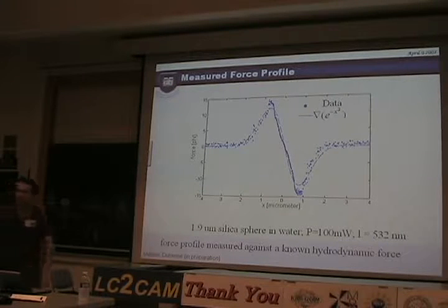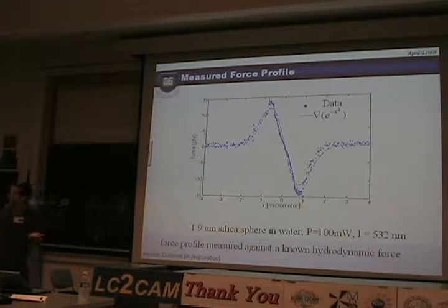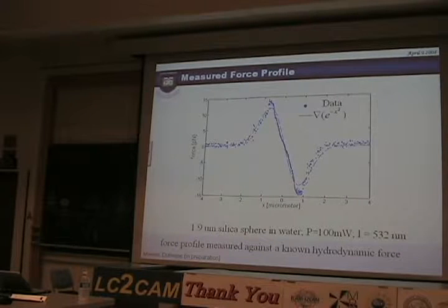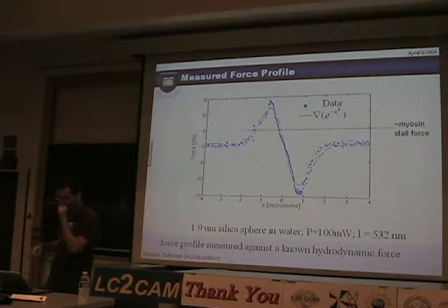And for those of you that know optics well, when you focus a laser beam, it makes a Gaussian spot. So using this, like I said, the force really does appear just to be the gradient of the intensity. All right, so let's calibrate this force scale for you.